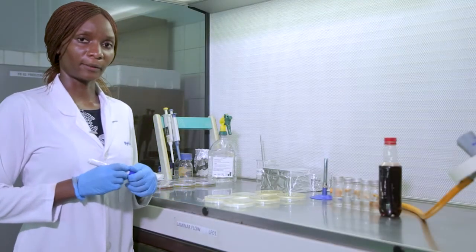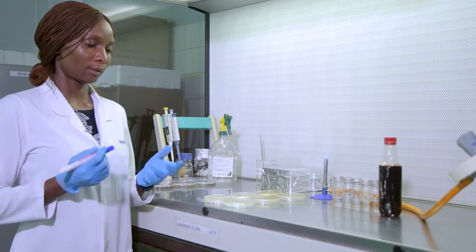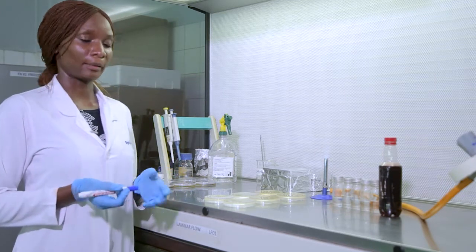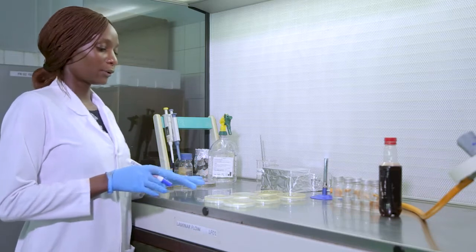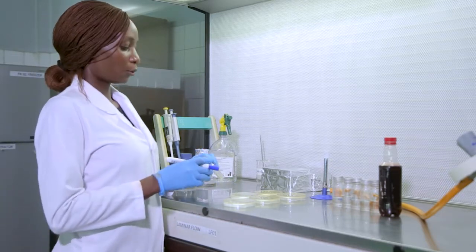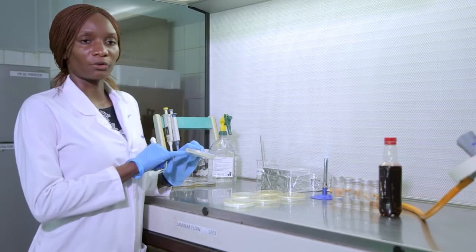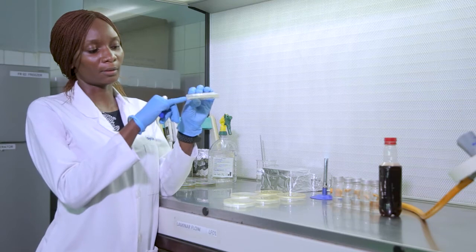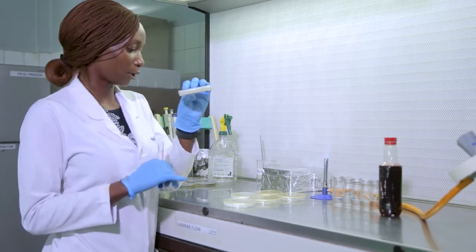Okay, so next I'm going to demonstrate the surface spreading, as some people call it surface plating or spread plate technique. So with this one, we already use pre-poured agar plates. So we already have our potato dextrose agar on the petri dish, and it has solidified. I think you can see the agar already in the petri dish.